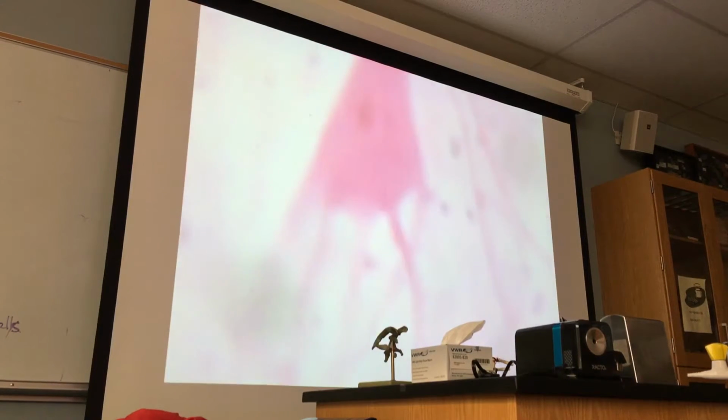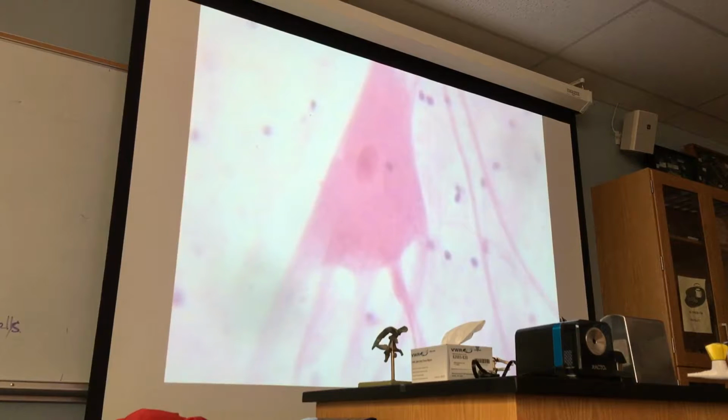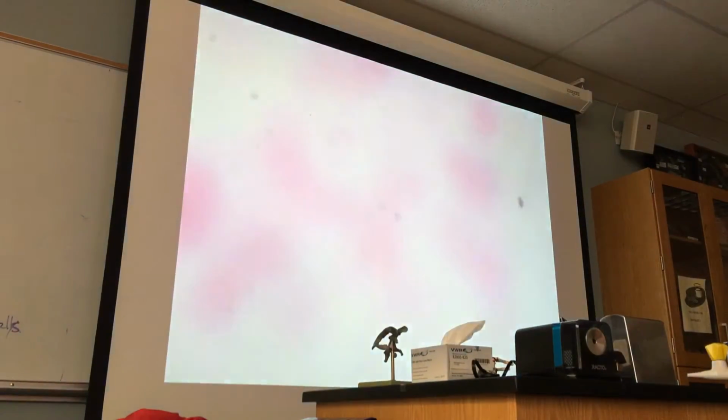Look at the nucleus. Look at these. These are neuroglial cells. Okay? This slide is over. We'll go to look at another slide.